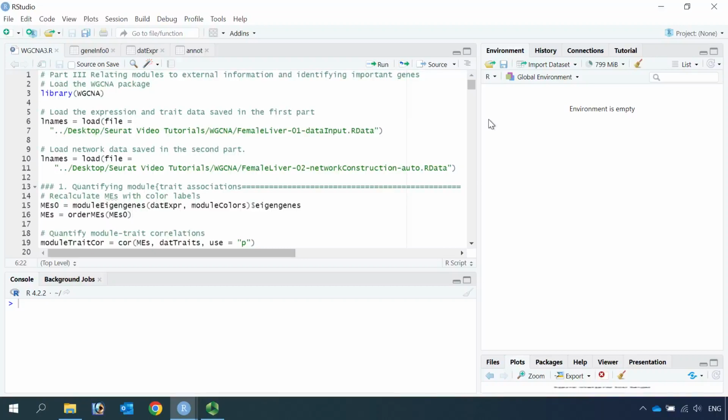Hi everyone, welcome back to my video tutorial for weighted gene co-expression network analysis. In this tutorial, I'm going to show you how to perform the analysis and correlate the modules to the trait data and also identify important genes in each module.